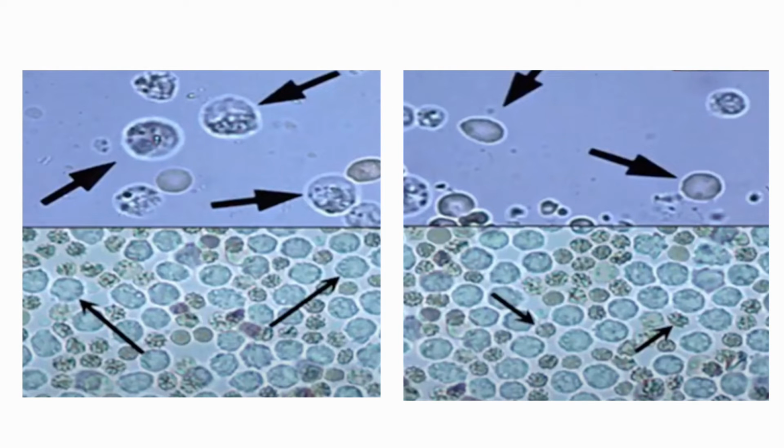So we see here a microphotograph of a urinary sediment showing the WBCs. These are the larger cells with granulated cytoplasm, while the rounded, enucleated smaller cellular structures are representative of the red cells in the urine.